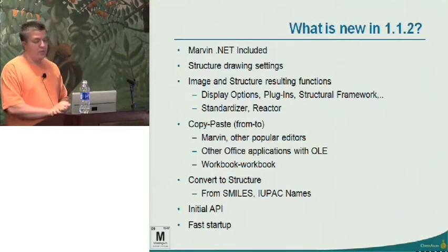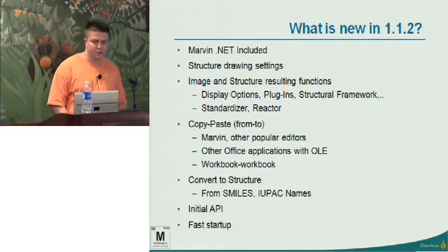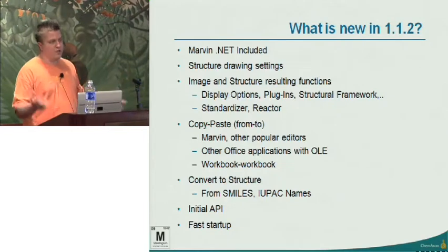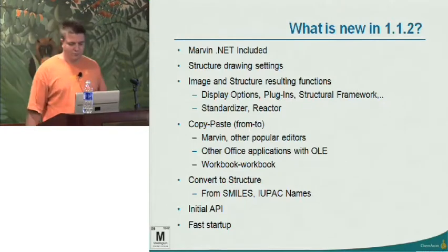Another requested feature was that we should be able to convert SMILES strings into structures in an Excel sheet. So if you have certain files with SMILES, it would be very nice to convert them with a function.